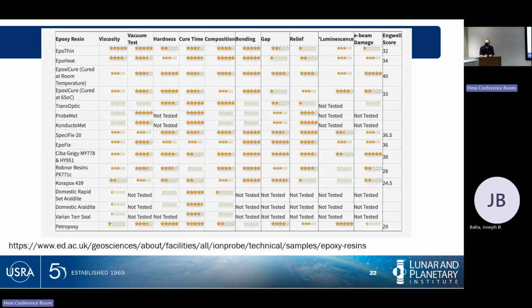If you really needed to care about something, there are a lot of people out there who have spent their time doing this to figure out what is best to use in labs. Mineralogists and petrologists will occasionally have discussions over what epoxy is used where and why. They are tedious because, well, it's epoxy.